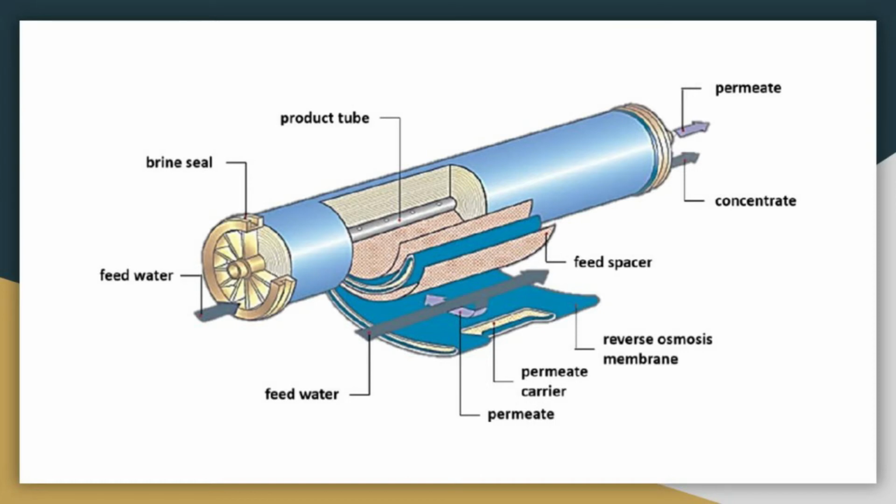It can minimize fouling, and it is difficult to clean and sanitize, but it is available for all applications, whether microfiltration, nanofiltration, ultrafiltration, or RO, reverse osmosis.